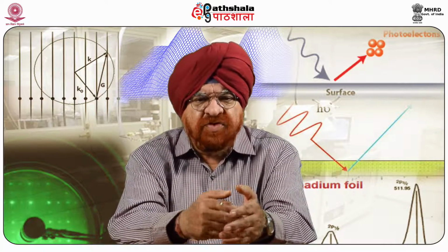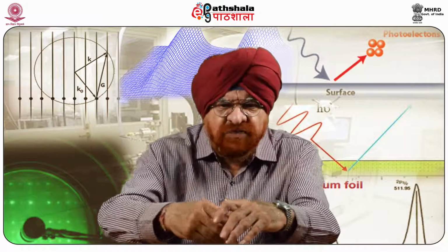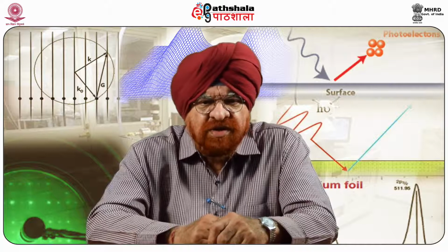The first AFM operated in contact mode was also started around about the same time. In contact mode, the tip is mounted onto the end of a flexible cantilever and raster scans the surface of the sample. The tip-surface interaction deflects the cantilever, which gives information about the surface topography. Samples can be analyzed in air, liquid, or vacuum.